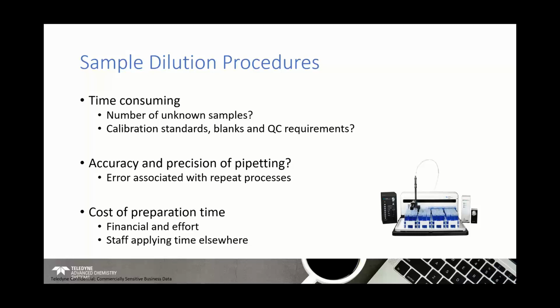And we might have multiples of the calibration standards. You might be sampling from the same tubes for calibration standards, or you might have prepared them separately. Either way, there is time required for preparation and dilution of these solutions. Typically, what you're doing here is repeat processes with pipetting: pipetting small aliquots of certain liquids, and then dilution with dilution media in larger volumes.